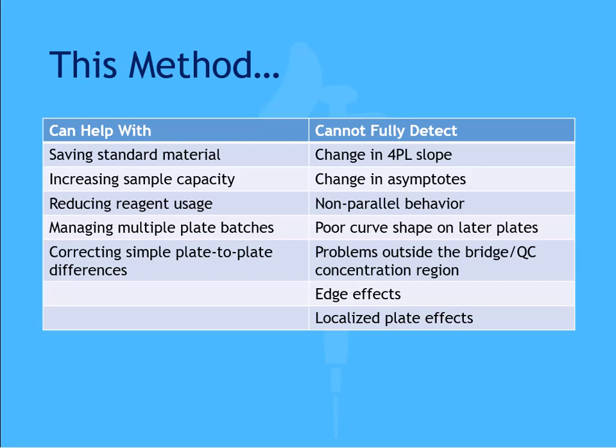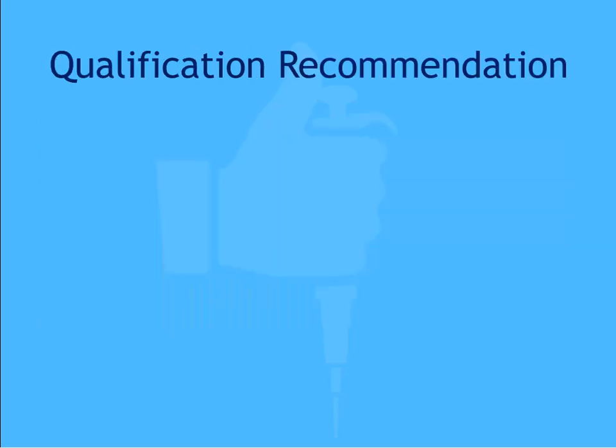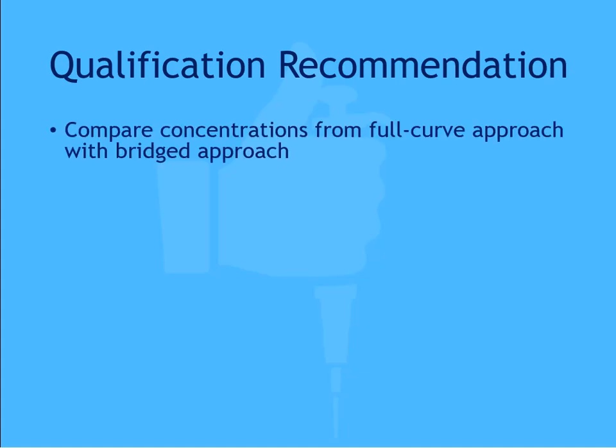Users should compare the reduced standard workflow against the conventional full curve workflow across representative runs and confirm that the sample concentrations and QC recoveries remain equivalent within predefined acceptance limits. Before adopting this bridge standard workflow routinely, it should be qualified and validated.